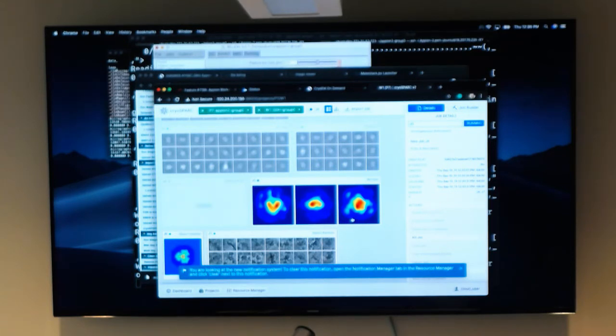Okay. Those classes will evolve as the iterations progress? Well, the main thing is it'll wait for the previous job to finish, and then forward that information. If you run, say, Cryosparc Live, yes, that means streaming. As you push in more, it'll evolve. But this is waiting for one task to finish before moving on to the next.